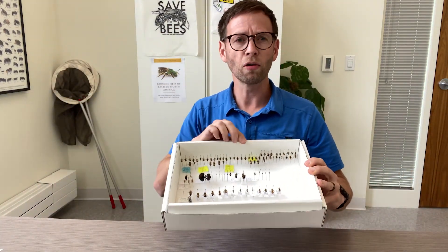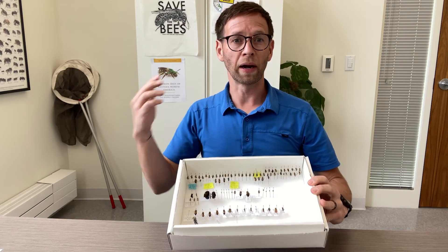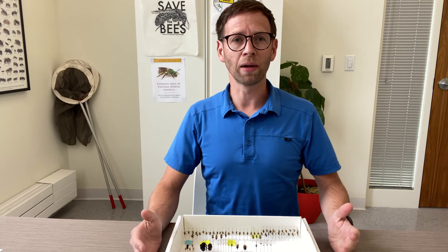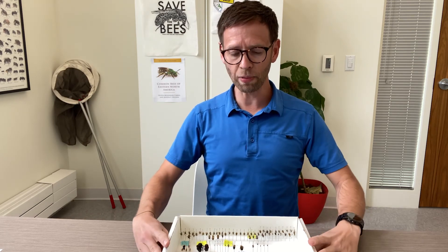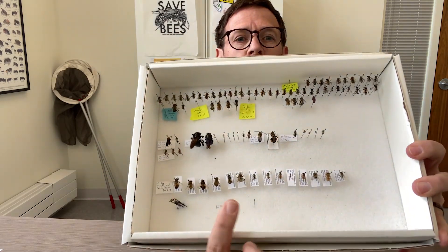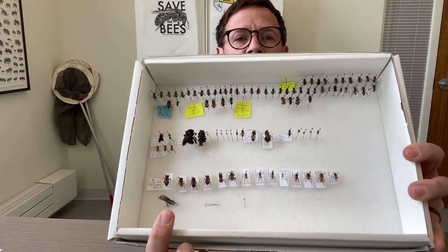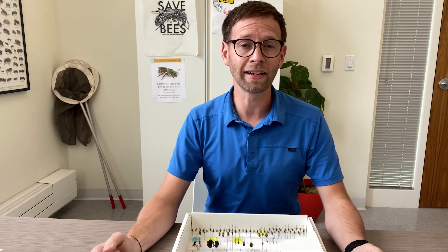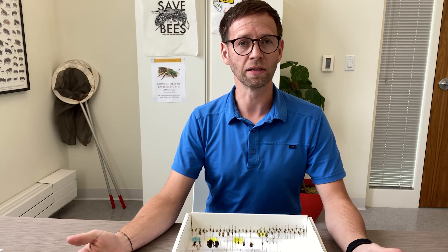I will pin those bees and bring them back to the lab. Then in the winter time, like right now, I will have time to go through and label the bees — each bee gets its own individual label — enter that data into the computer, and also spend time identifying the bees.